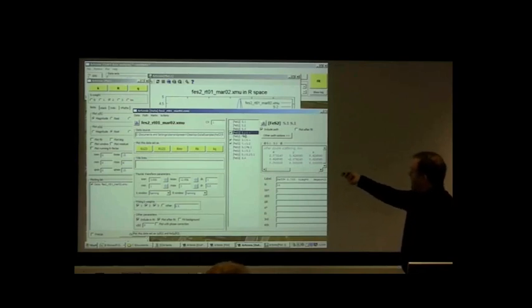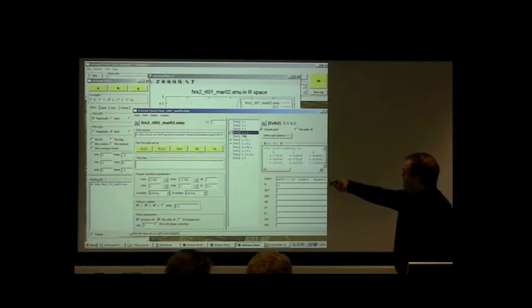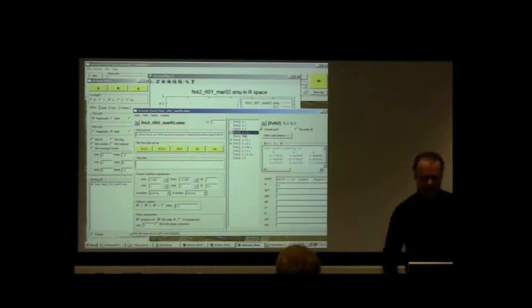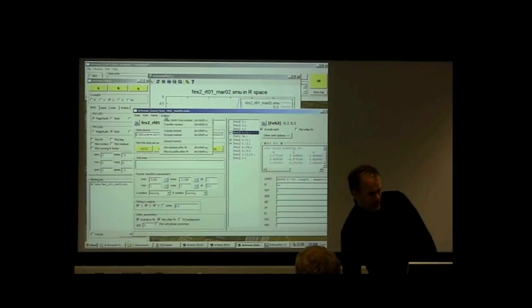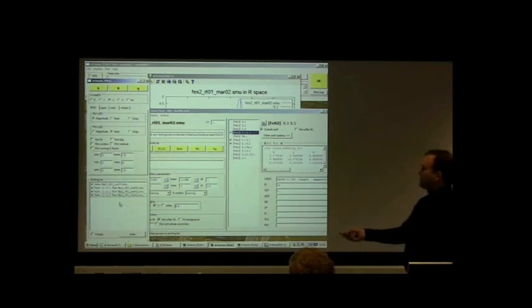There's a bit of automation. We can mark some of the paths and then go in the Actions menu and say Transfer Marked. And that says to transfer them over to the plotting list. So now we'll be able to plot the data and those three multiple scattering paths.